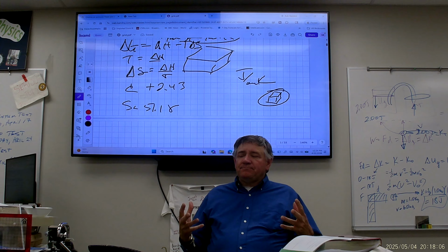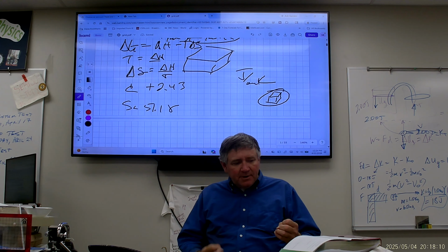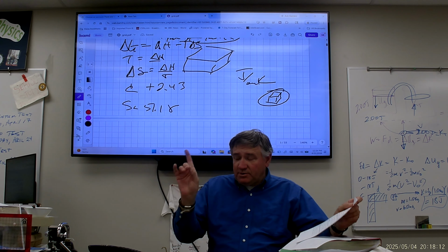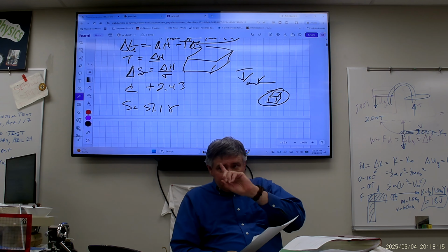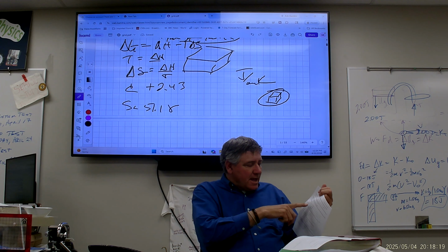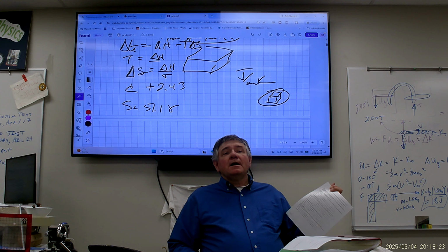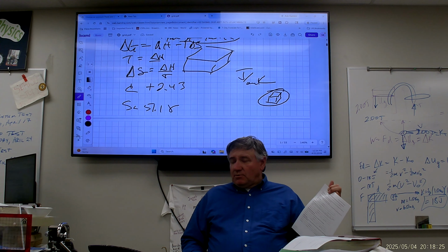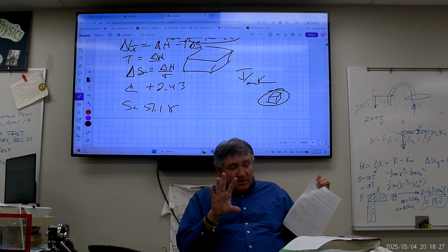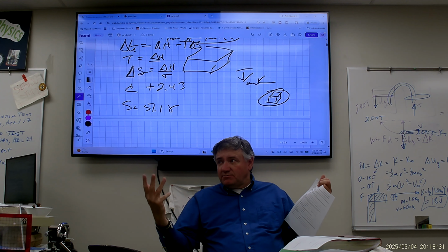And number 1, and again, stay with the spirit of how I wrote this lab. The first reaction we're going to do together. I'm going to take concentrated hydrochloric acid and sodium bicarbonate, otherwise known as baking soda. Okay? And we're going to mix that together. We're going to do this all together as one group, and we're going to make observations. I'm going to measure temperatures, and we're going to see what happens.